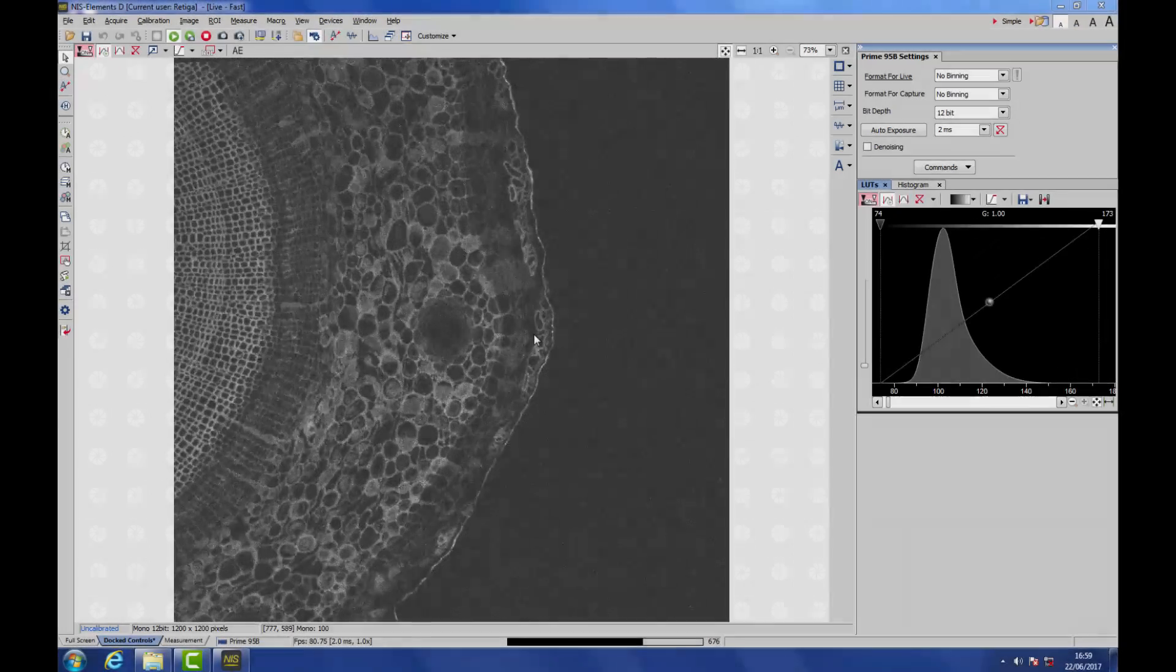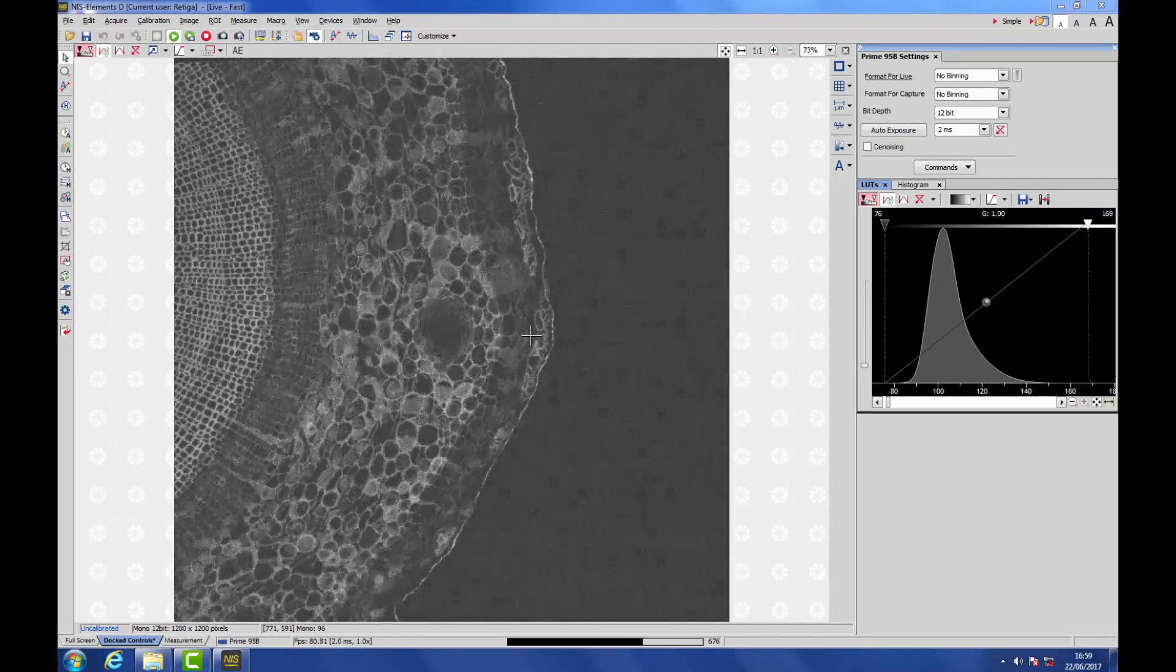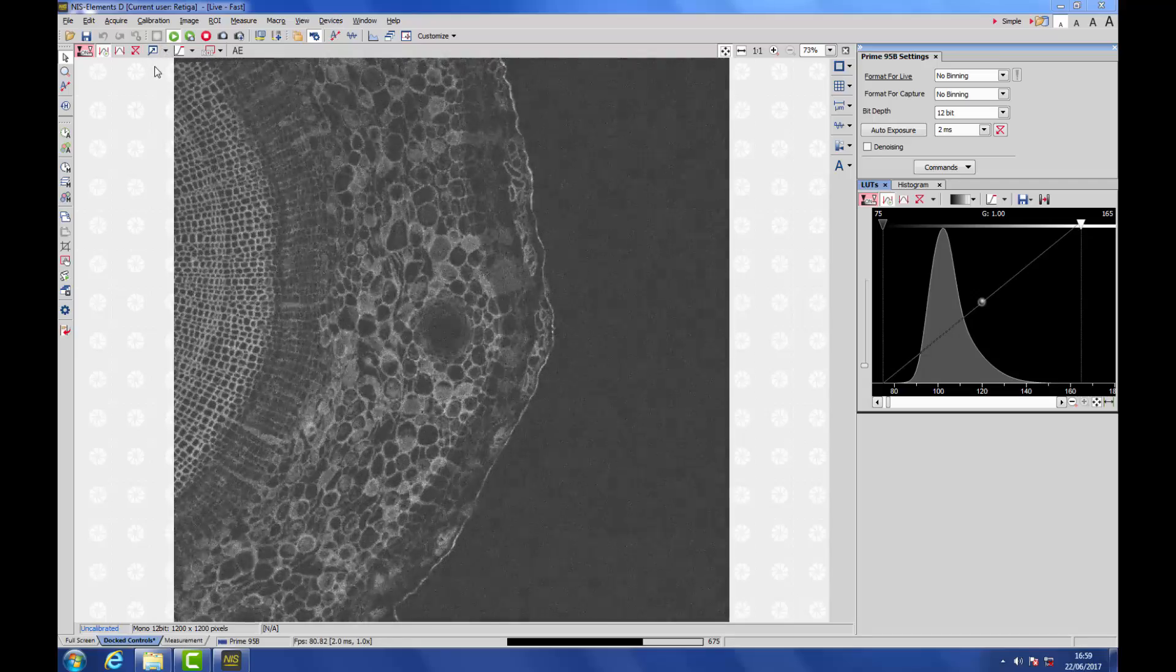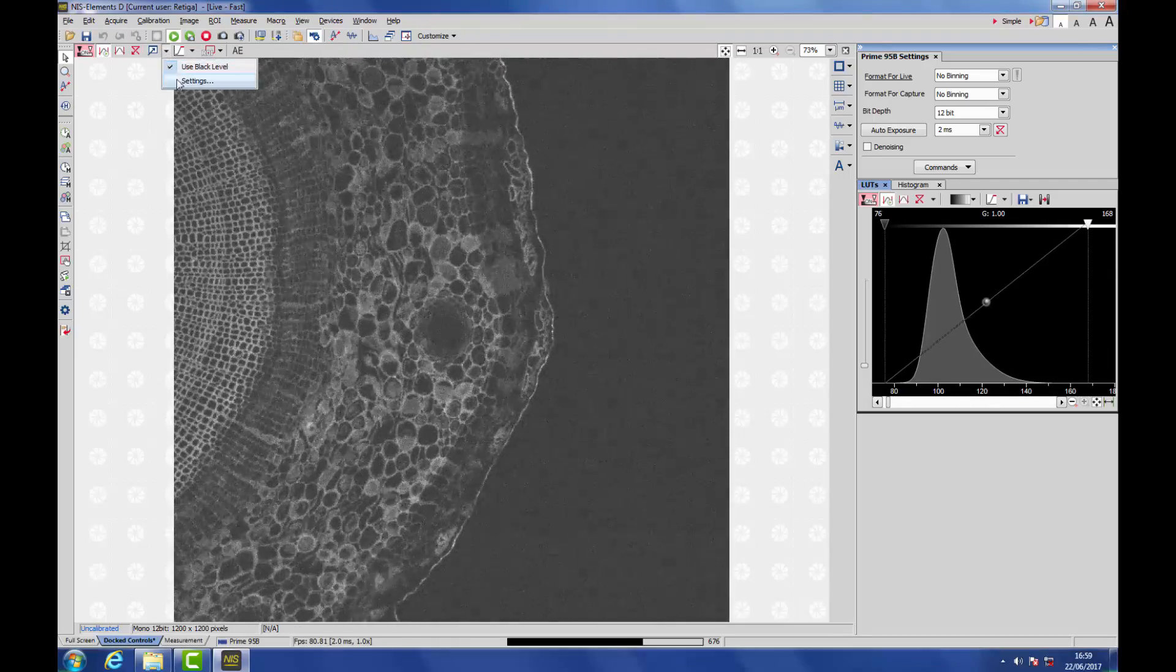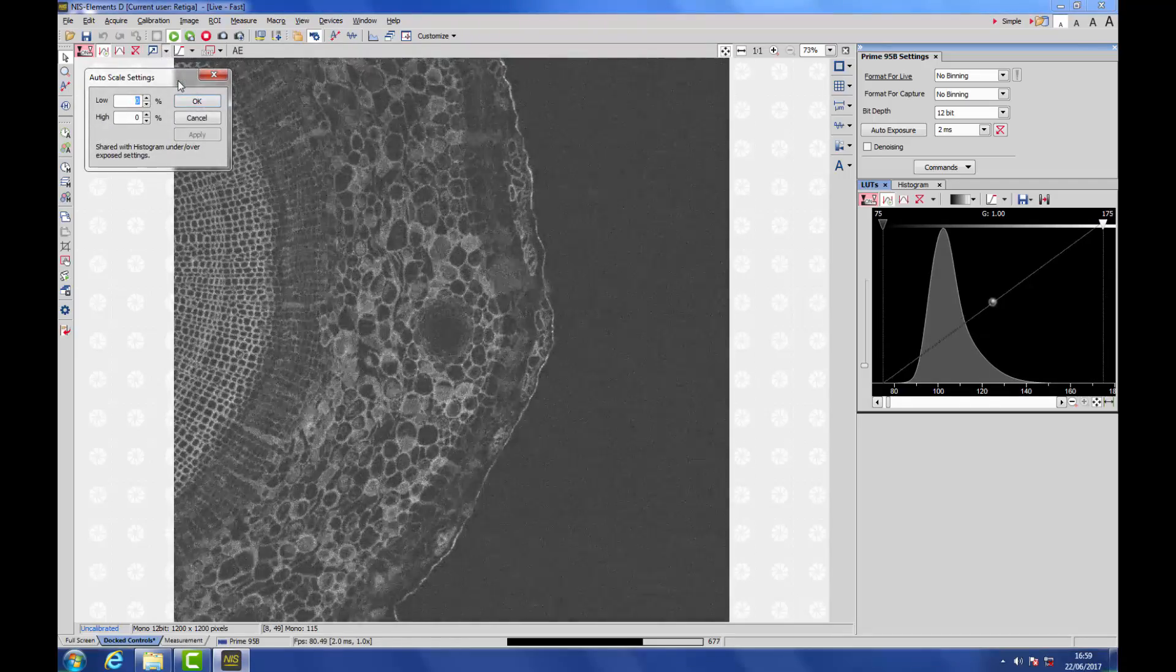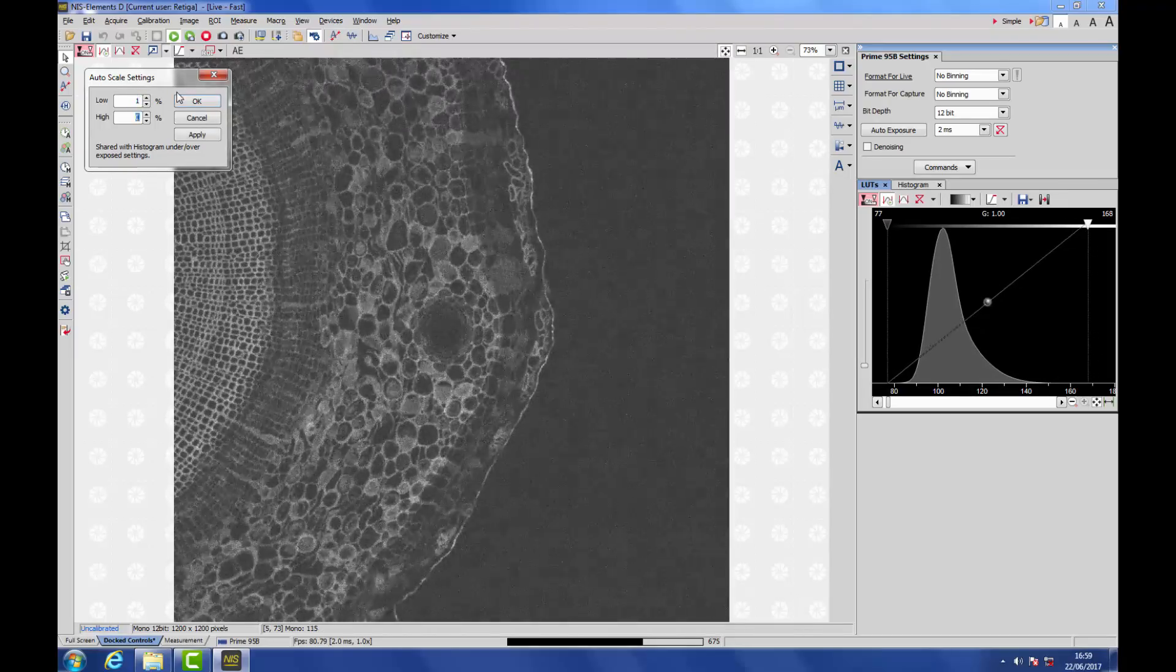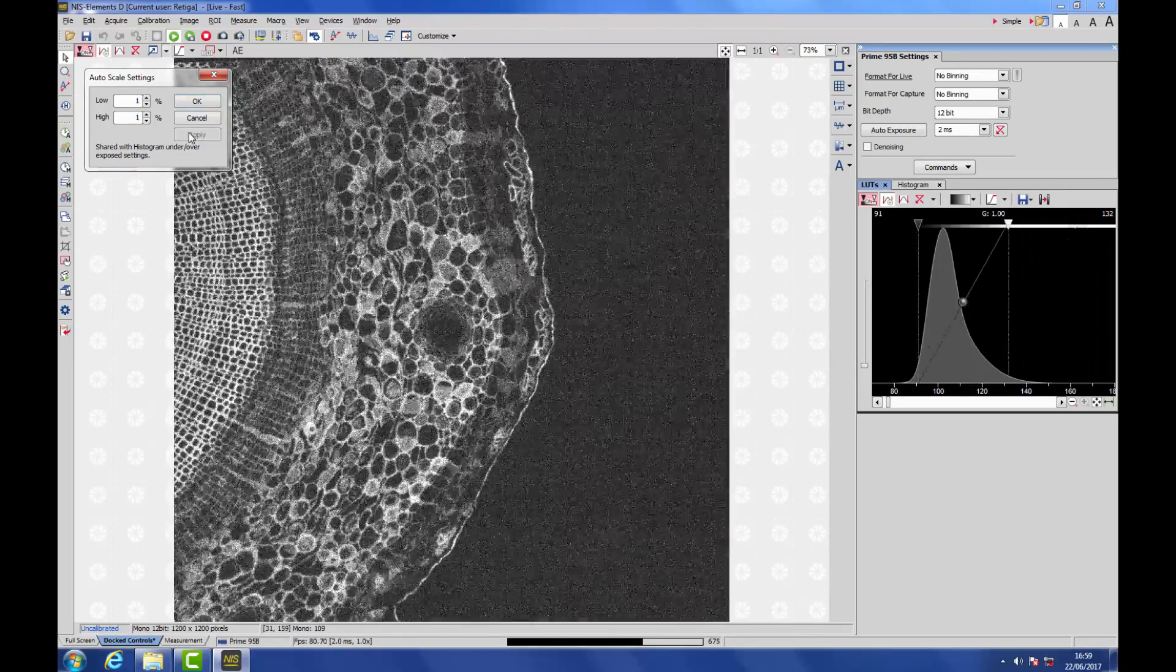One area in which the 95B particularly excels is in low-light imaging, but the display of this data can sometimes be a little difficult. So here we have a very grey image. This is what you get if you don't specify your auto-scale to ignore any of the brightest and darkest pixels. So here we're ignoring 0% of each.